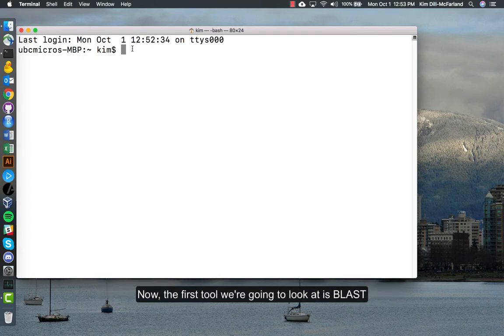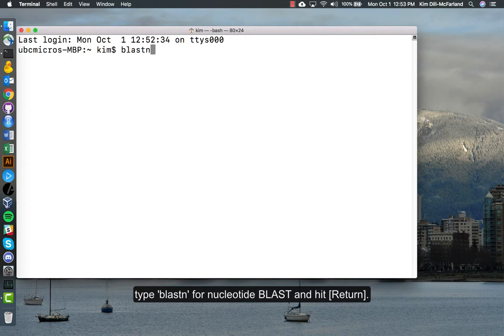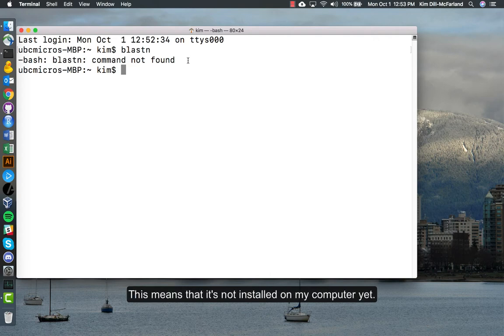Now the first tool we're going to look at is BLAST. To test if you have BLAST installed on your computer, you type blastn for nucleotide BLAST and hit return. We see that it says BLAST not found. This means that it's not installed on my computer yet.